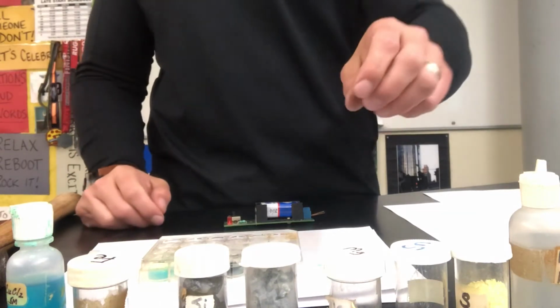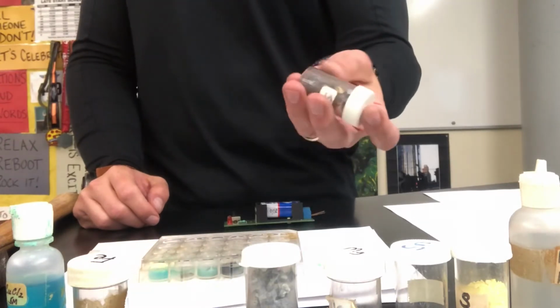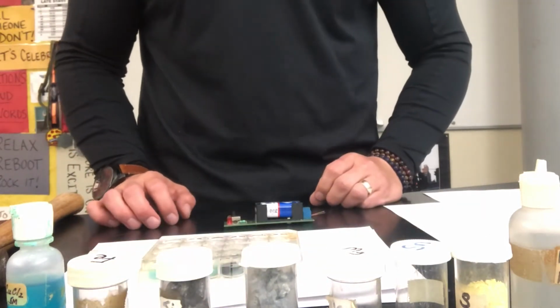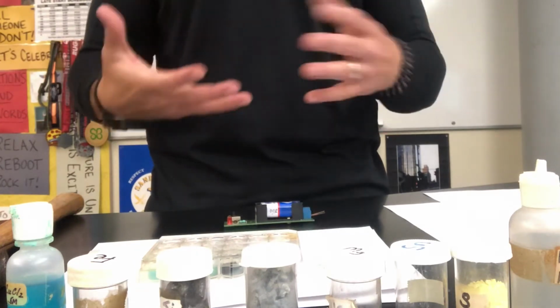And then also that final one, crazy silicon. It kind of looked like a metal, but it was brittle like a nonmetal. What is up with that silicon, and where is that located on the periodic table? So, this is hopefully a fun way to start exploring the world of metals and nonmetals.